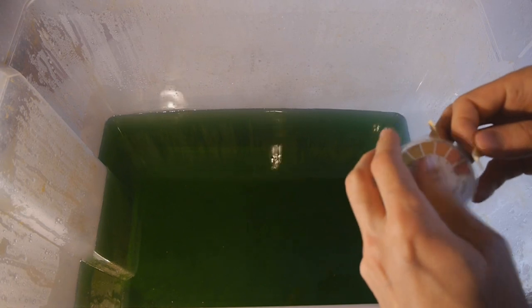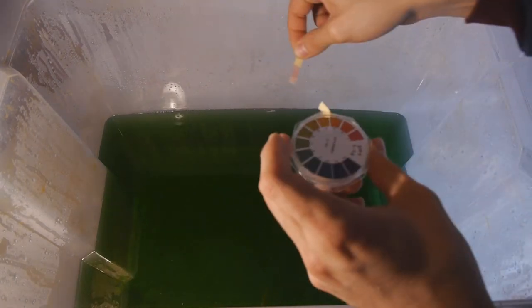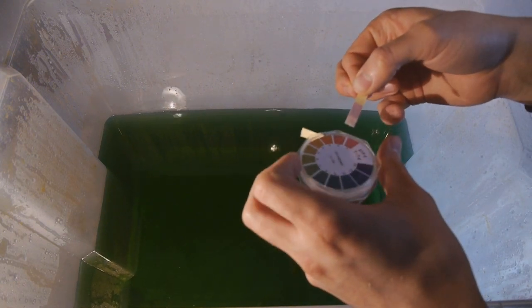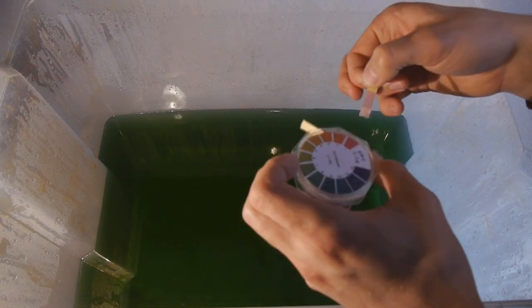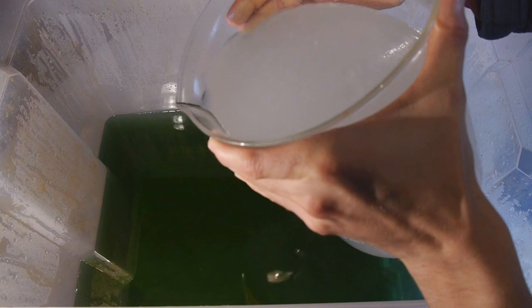Before we start, I want to quickly measure the pH of the solution. Now it should be highly acidic. Well, this pH paper is very old, but I guess that should be a pH lower than 1. Alright, let's see if it changes once we have added the sodium hydroxide. It definitely should. Okay, this is very hot and heavy, but I'll try my best.